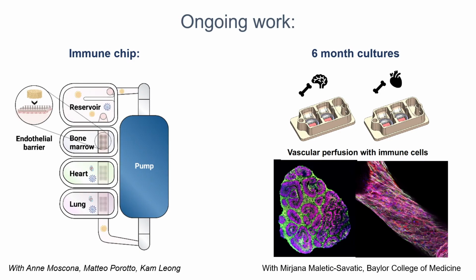She is culturing bone marrow and brain organoids linked together. So we are looking into longevity and ability of these tissues to be models of ischemia, but we are using the very same platform, same methodology, same everything. So this is an effort to do cross-validation of some of the data between the 2 labs.